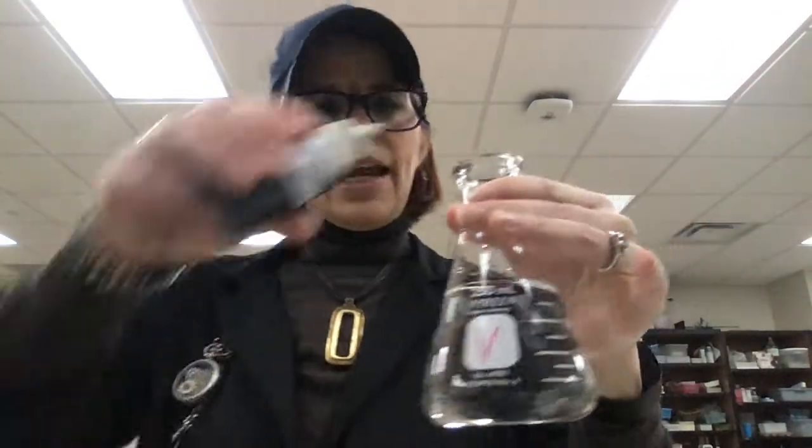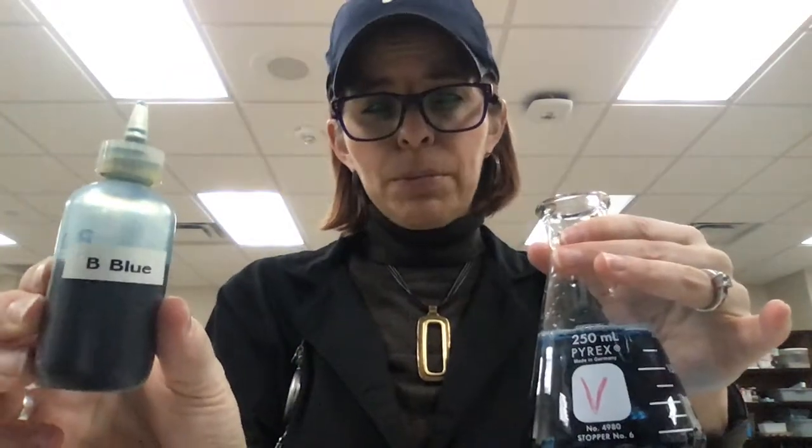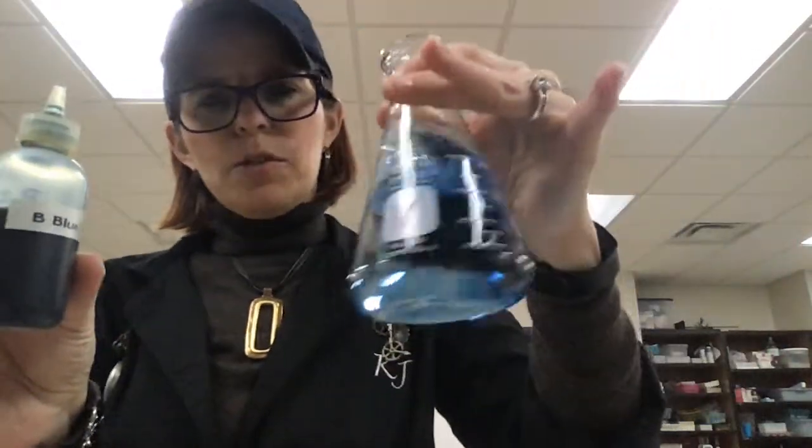So here I have some distilled water, and I'm going to add into it a chemical indicator that is called bromethymol blue. Bromethymol blue is blue in a neutral pH or in a basic pH. So this can be used as a pH indicator. And it turns yellow in an acid.